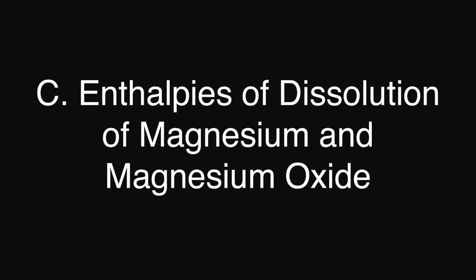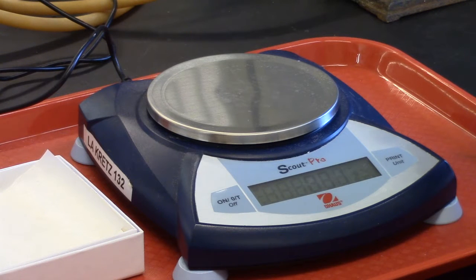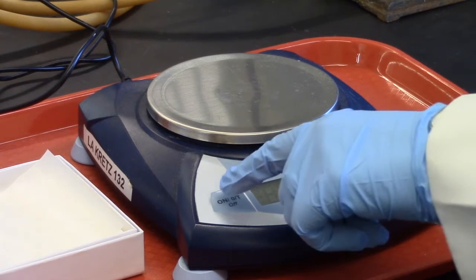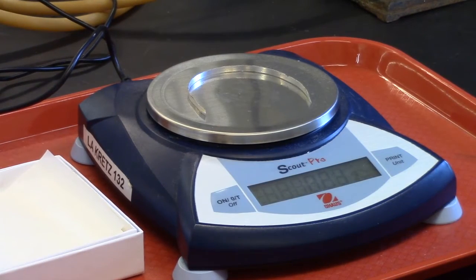Part C, enthalpies of dissolution of magnesium solid and magnesium oxide. First, weigh the magnesium strip, but make sure the balance is set at zero. Record the mass of the magnesium in the notebook.